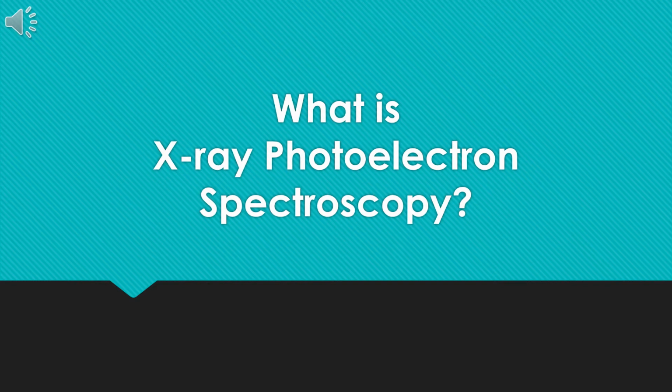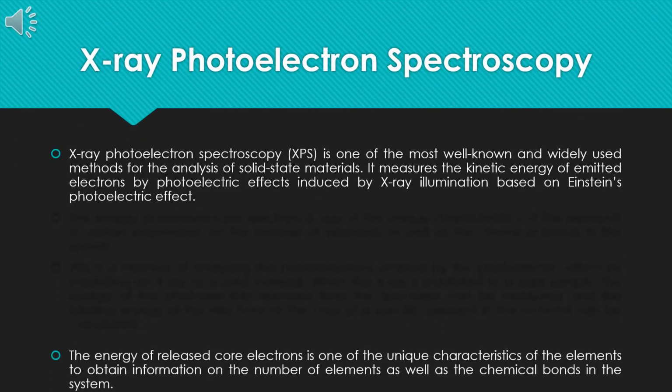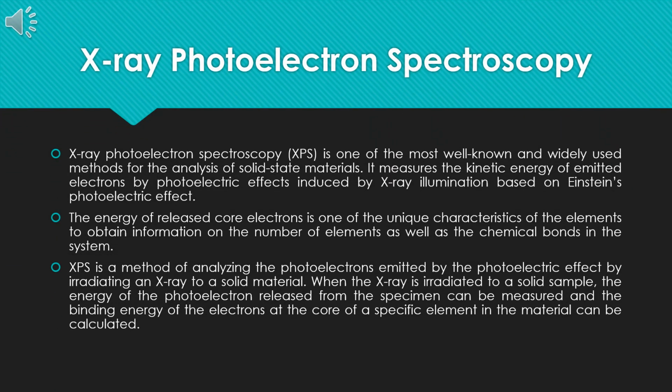What is X-ray photoelectron spectroscopy? X-ray photoelectron spectroscopy (XPS) is one of the most well-known and widely used methods for the analysis of solid-state material.